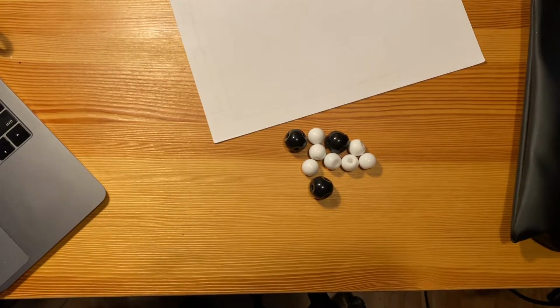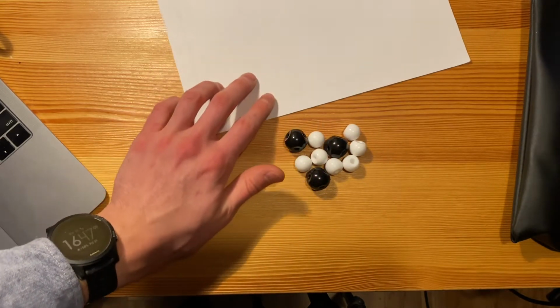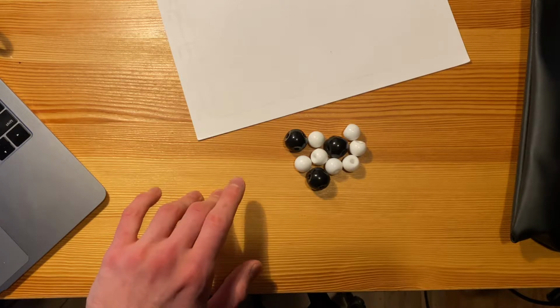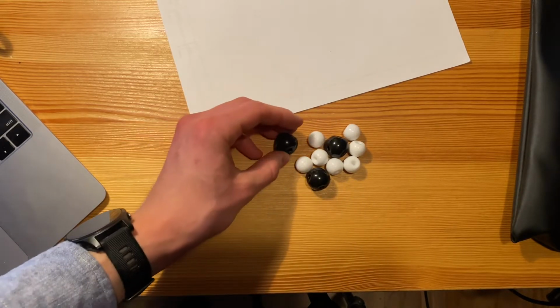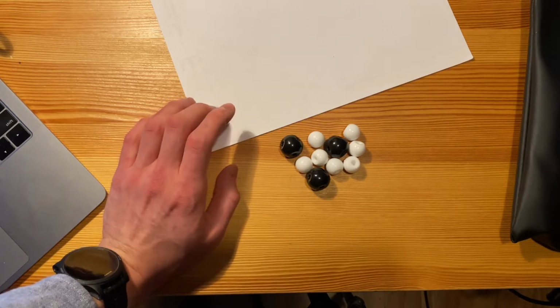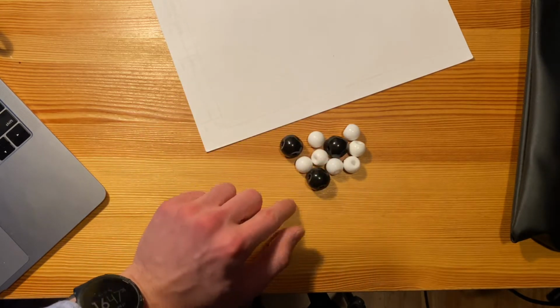All right, so this is the washing method model. So here we have a solvent, and then we have a compound which we want to wash. So washing is the process in which you remove something that you don't want from a different compound using a solvent. The one caveat that has to be mentioned is that the unwanted material has to be more soluble in this solvent than in the mixture that it's already in.